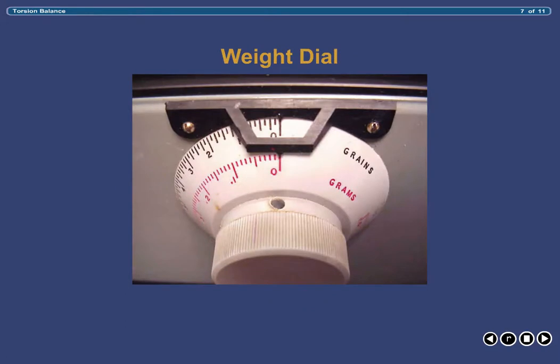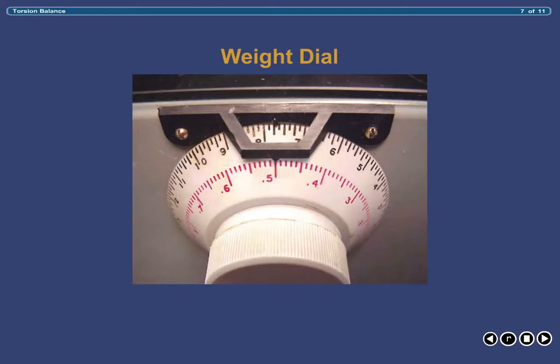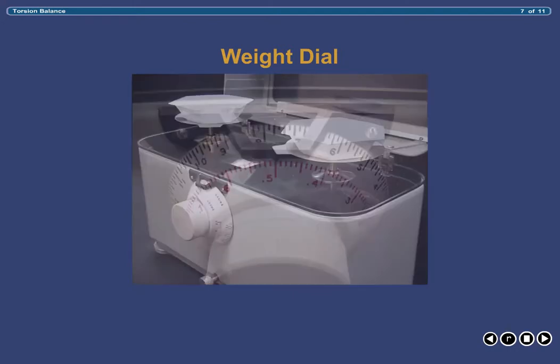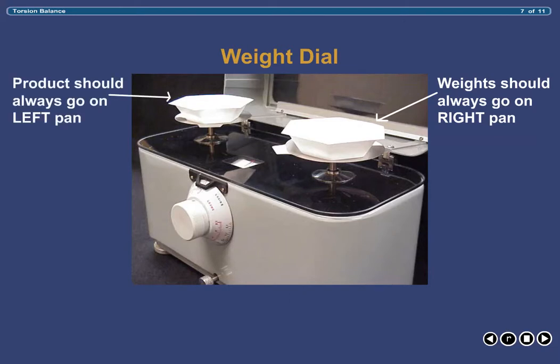The weight dial is located on the front of the balance. Rotating the dial clockwise allows you to add weight in increments up to one gram by simply dialing in the desired weight. By design, when the dial is used, the balance adds that weight to the pan on the right side. Therefore, when weighing, you must always place your weights on the right-hand pan and the product on the left-hand pan. If you forget, simply release the locking arm, dial in some weight, and observe which pan drops — it will always be the right-hand pan.